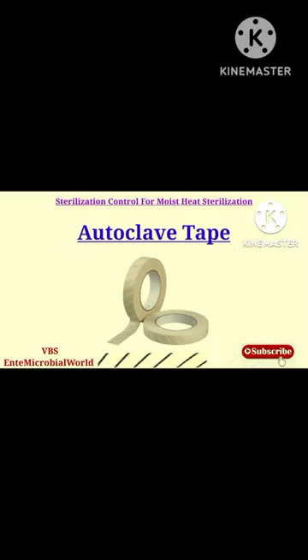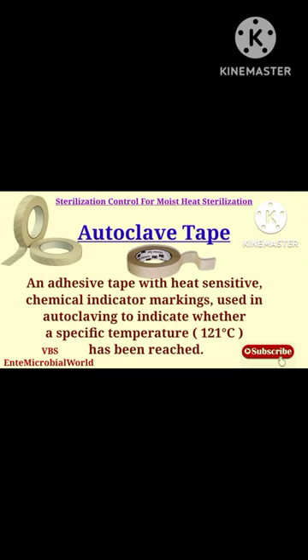Autoclave tape is an adhesive tape with heat-sensitive chemical indicator markings used in autoclaving to indicate whether a specific temperature has been reached.